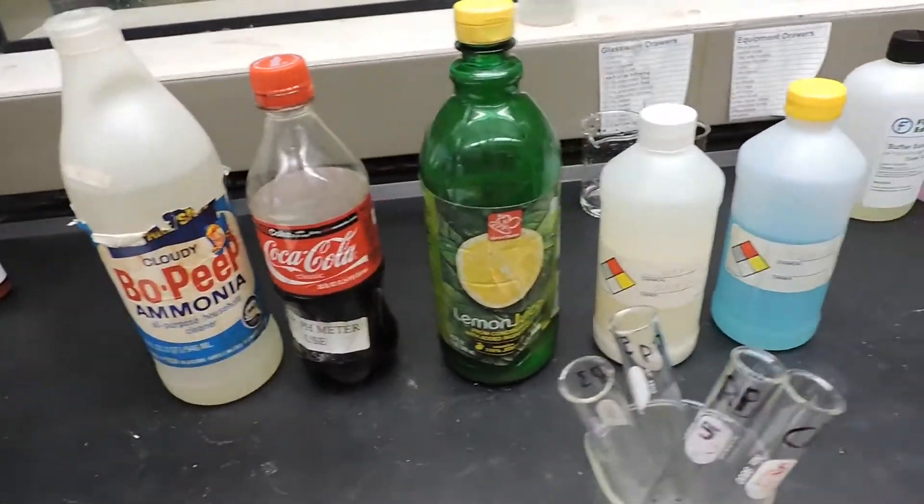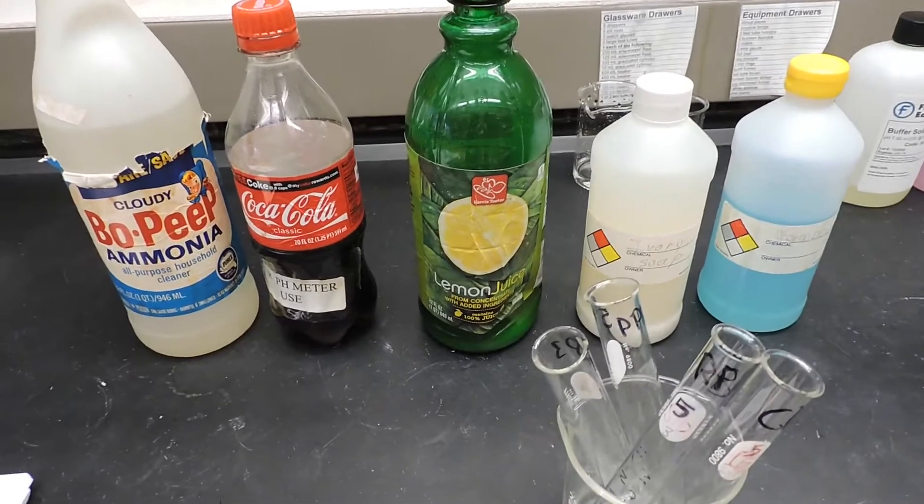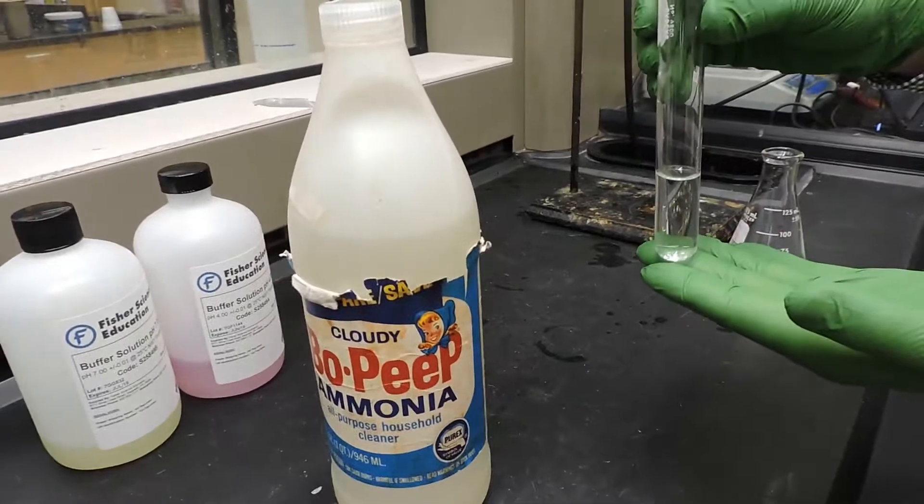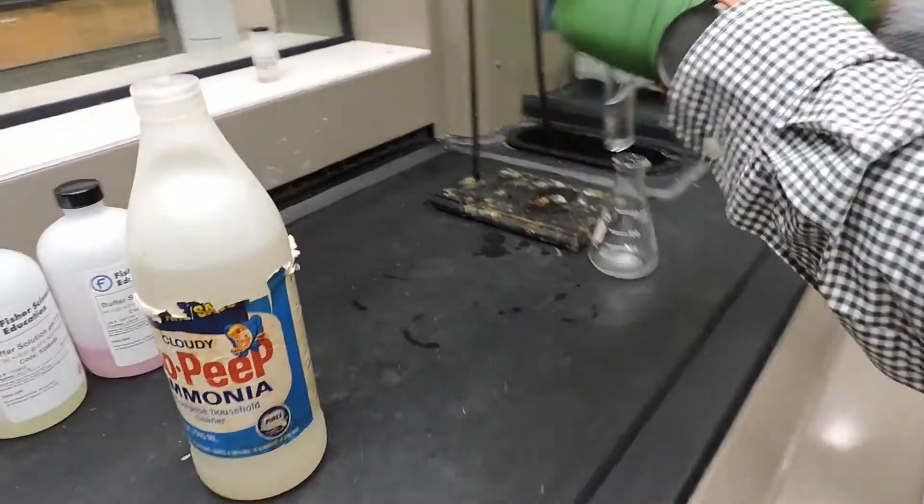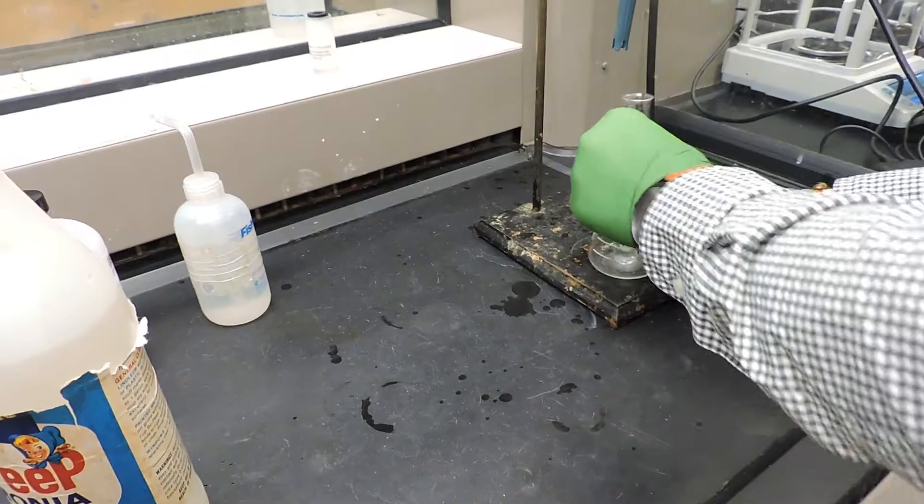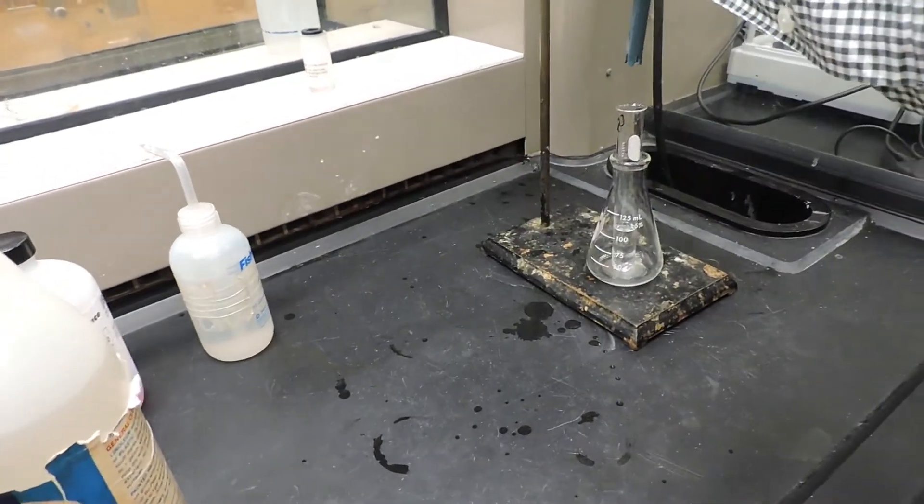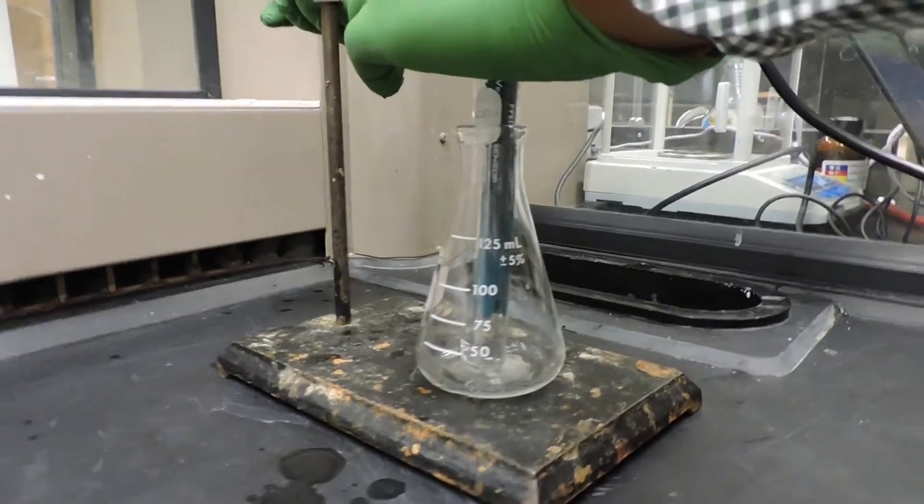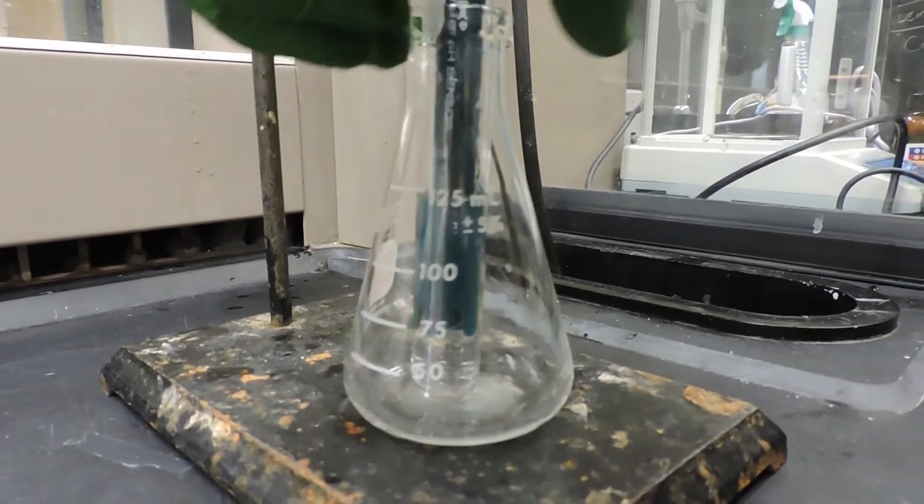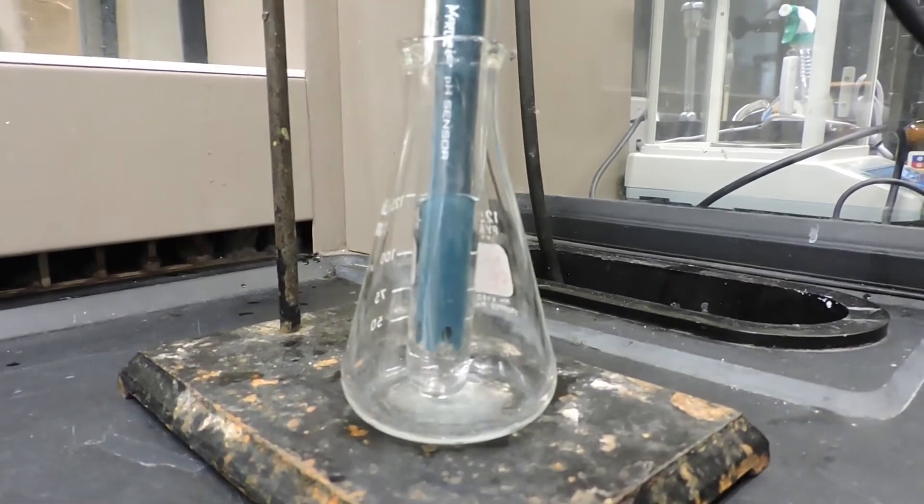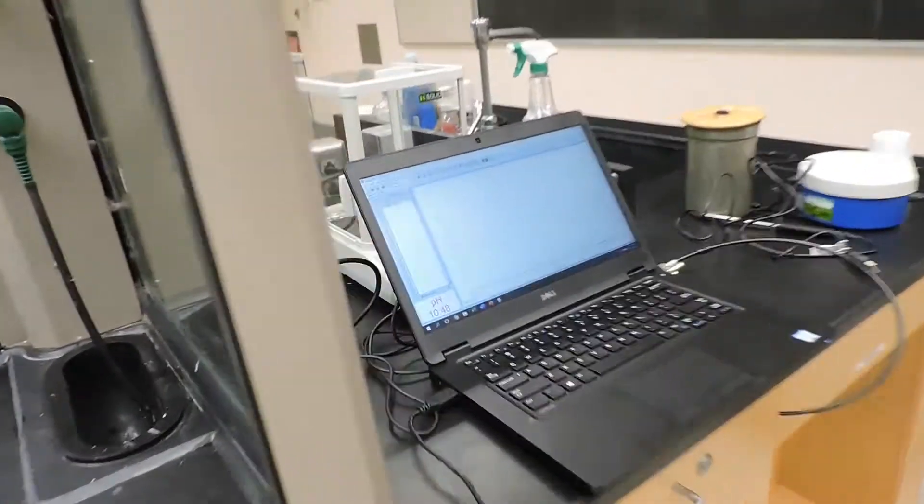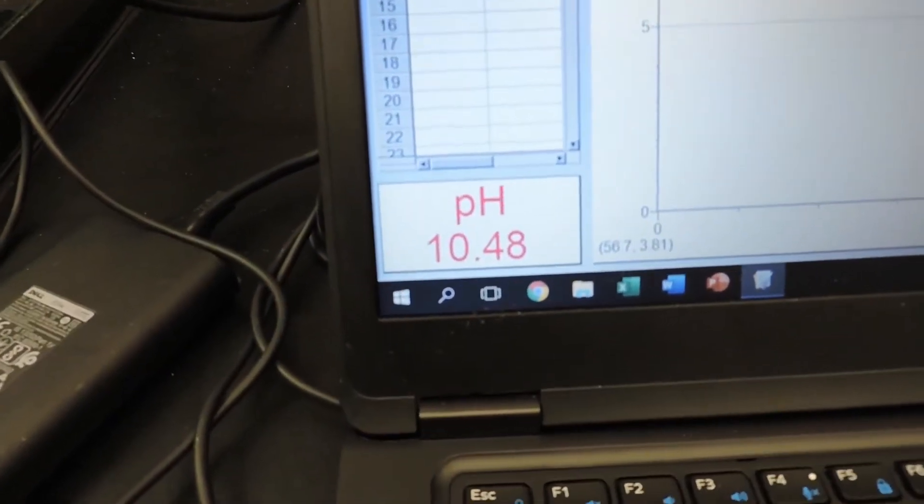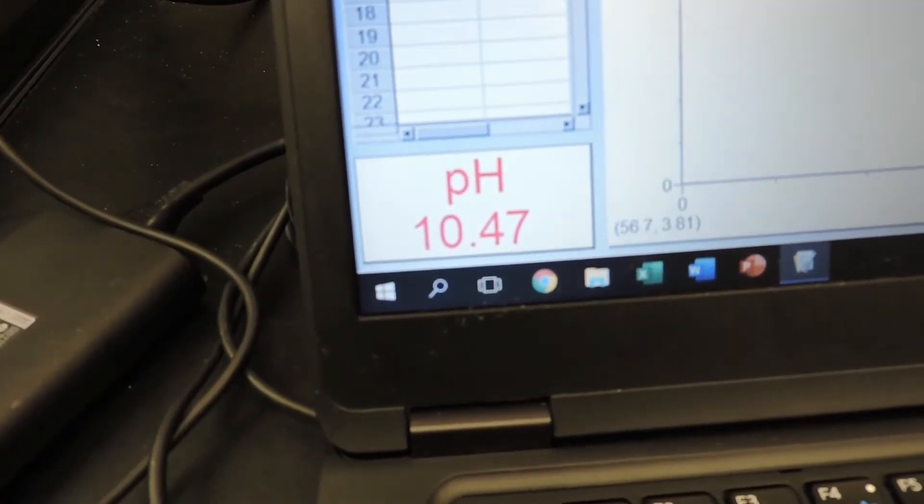Here we have various different substances that we're going to test the pH for each of them. The first one that we're going to do is some ammonia. We're going to pour some in a medium-sized test tube or a large test tube, and we're just going to dip the probe into the solution as you can see here. Our Logger Pro software will tell us the pH. So the pH for ammonia is 10.47.